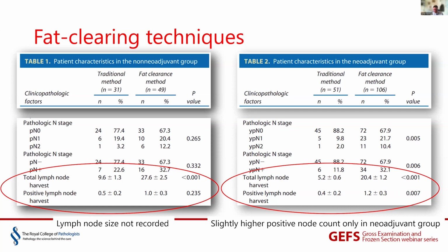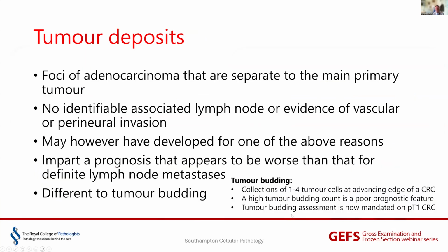The difficulty is there are potential health and safety issues with having large containers full of that absolute alcohol or other solutions that might contain, for example, glacial acetic acid within your laboratory. So most labs don't do this, although some do.